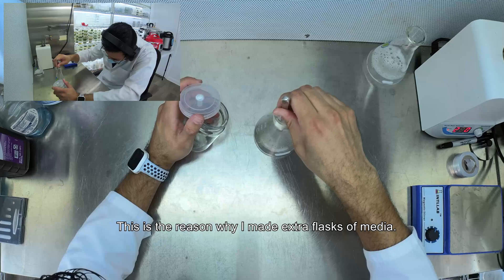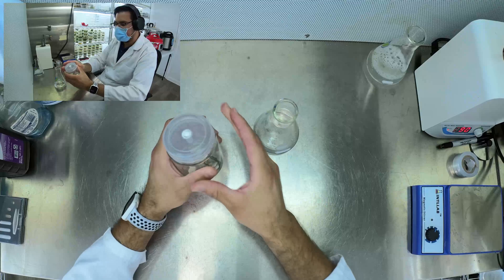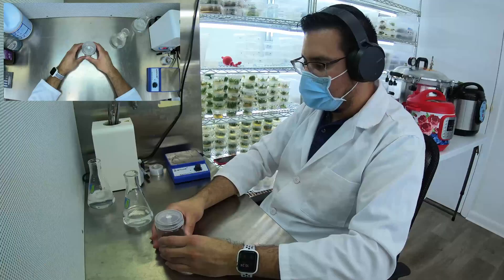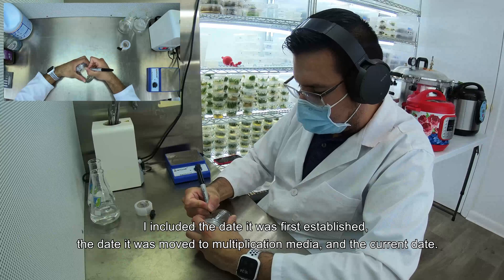After 1 minute, move the explant to a layer. This is the reason why I made extra flasks of media. Seal and label the flasks. I included the day it was first established, the day it was moved to multiplication media, and the current date.